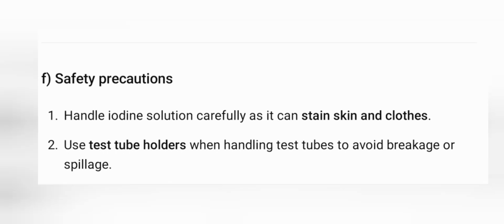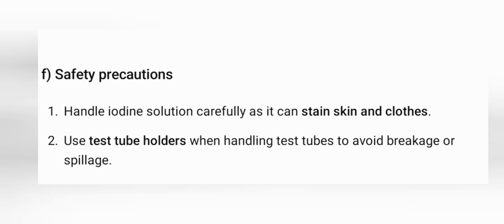Safety precautions when doing this practical. Handle iodine solution carefully as it can stain skin and clothes. Don't touch it, don't spill it on your clothes. Use test tube holders when handling test tubes to avoid breakages or spillages.